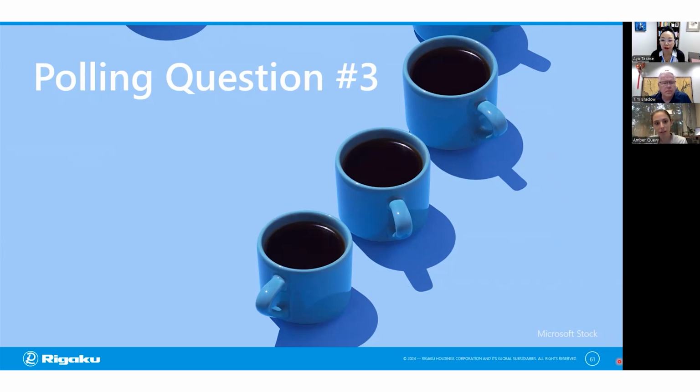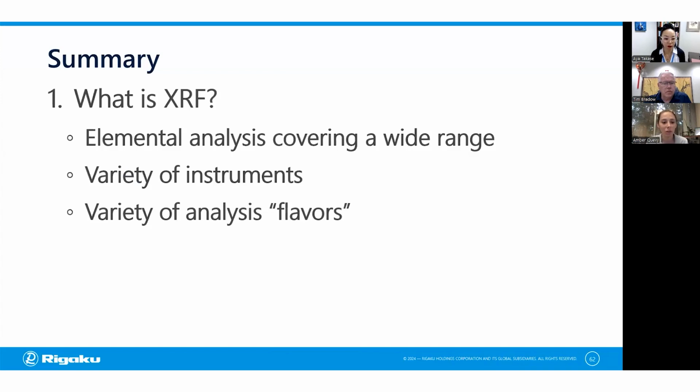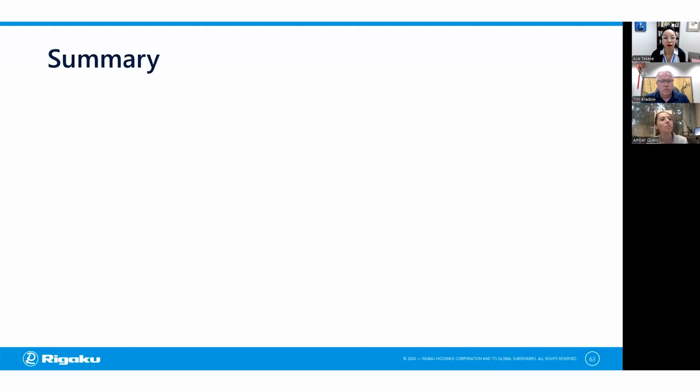All right. At this point, I think we're just going to wrap up. We set out to answer the question of what is XRF, and hopefully we've convinced you that we can look at a wide range of materials and elements. There's a variety of instruments on the market. They come in different shapes and sizes, and different analysis flavors. So hopefully there's something that can meet your need and your budget.